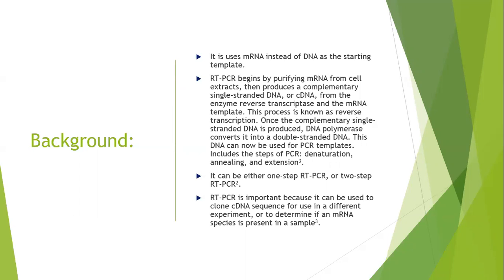and PCR. So cDNA synthesis occurs in one tube and then is transferred to another tube in order to be amplified by PCR. It can use random hexamers or specific gene primers, and it's ideal for multiple gene analysis.